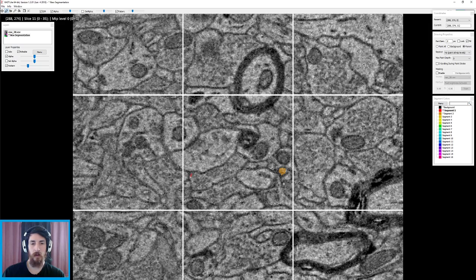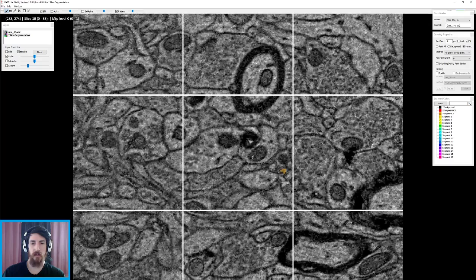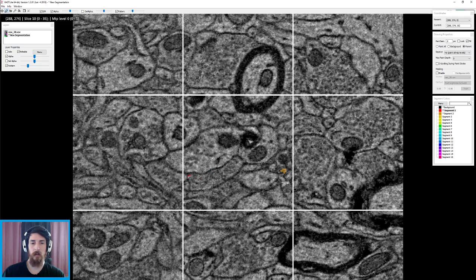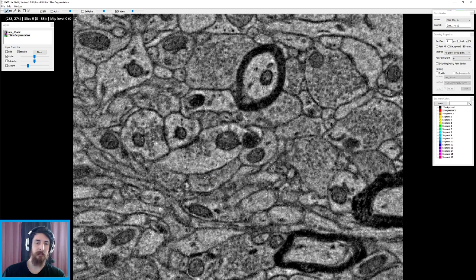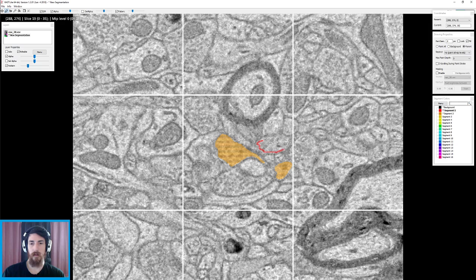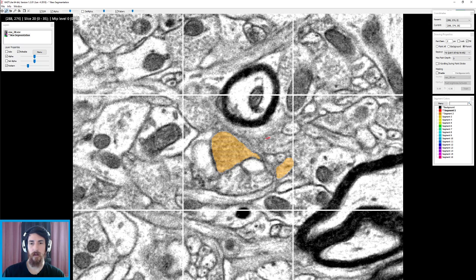Okay. Just finishing up this segment here. Is that? Yes, it is. All right. There we go. And it exits the volume. Does it exit on this side? Not yet. Okay, so here we are hallucinating some boundaries. There we go.